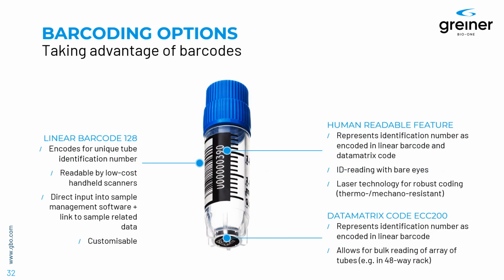Here you see an example for such a barcoded cryovial. The vial has a unique identifier. In this example, it starts with the letter U and there are digits following. This identifier is unique. You will find no tube with the same identifier in your cryostore.